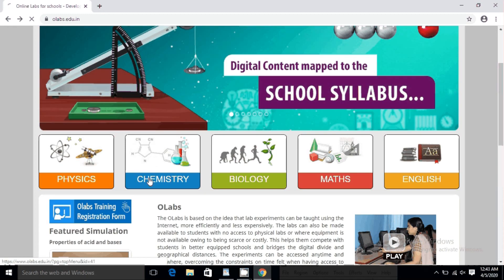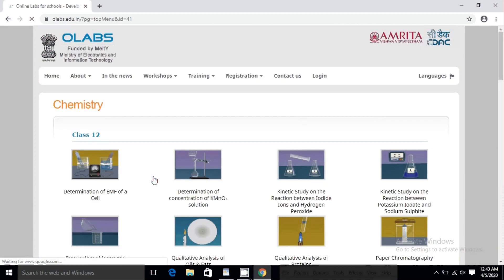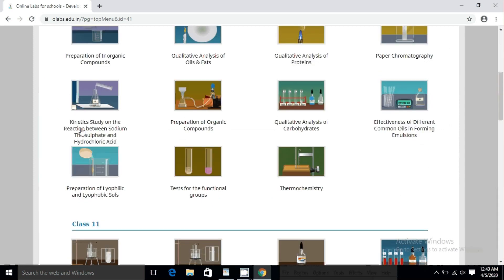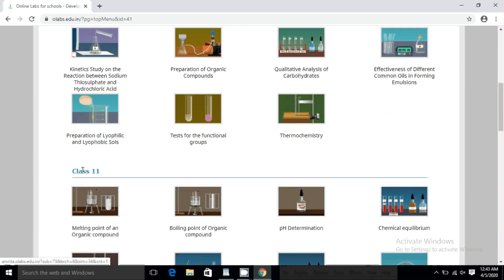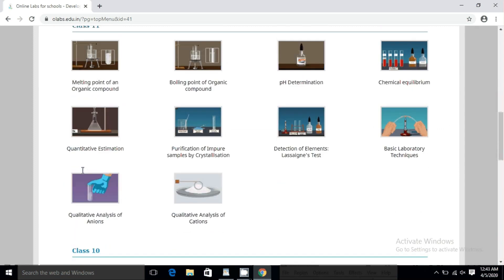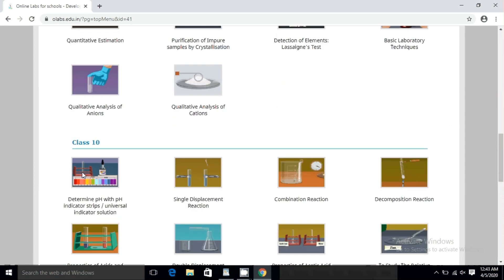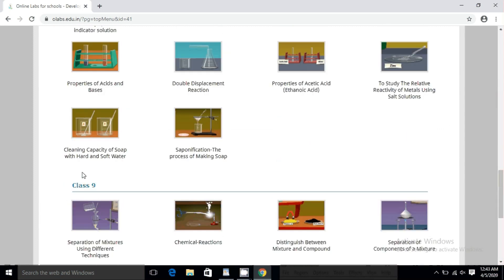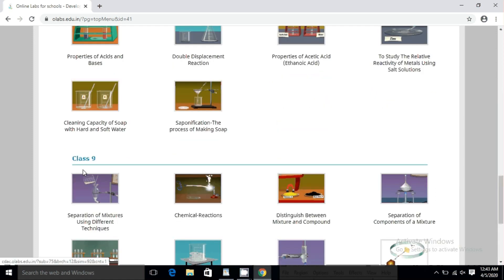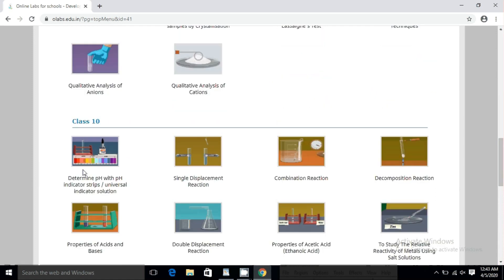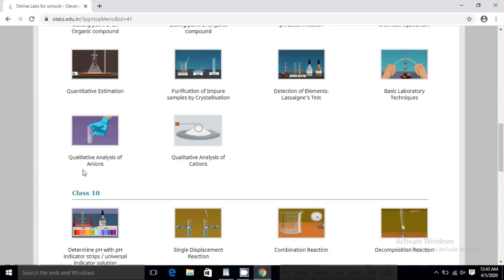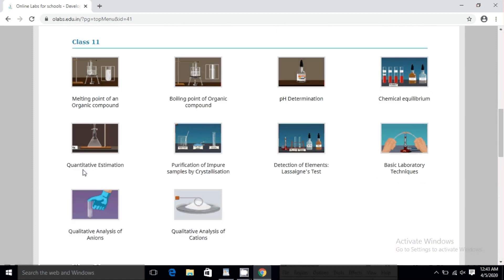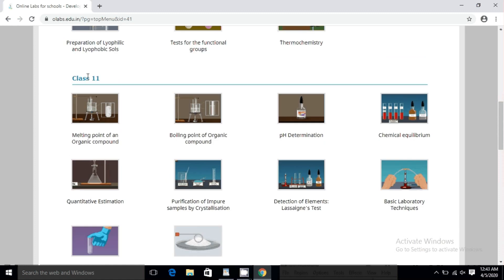I will show you an example in Chemistry — how to calculate your pH value. These are the different practicals available under class 12, class 11, class 10, and class 9. Let us take the example of pH determination.